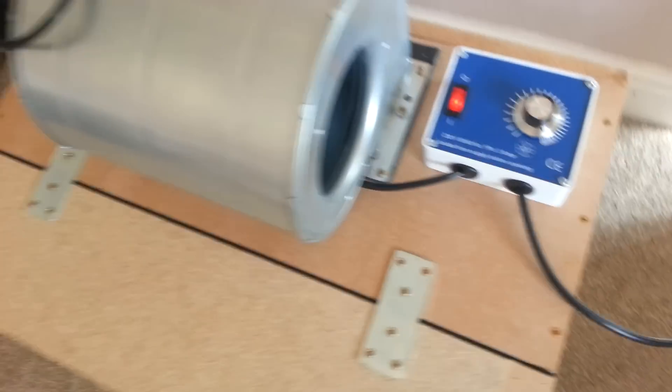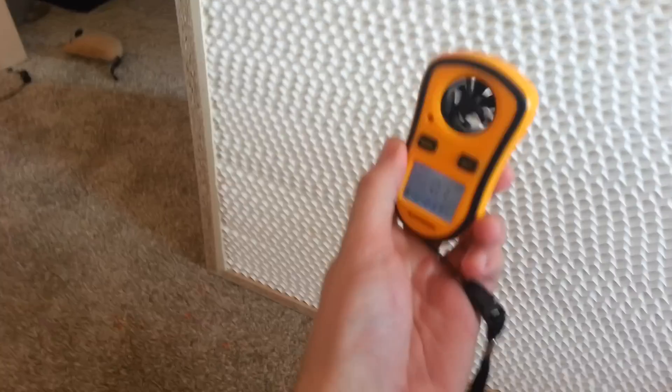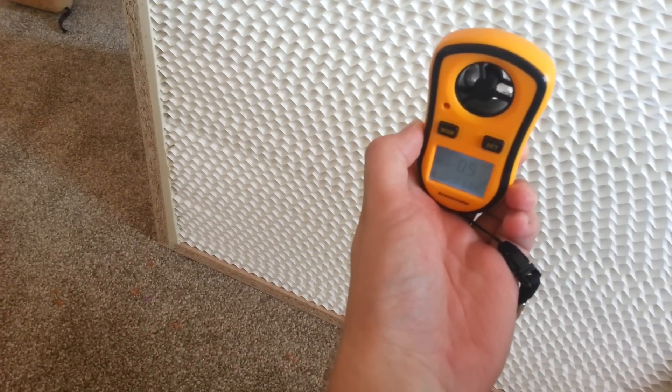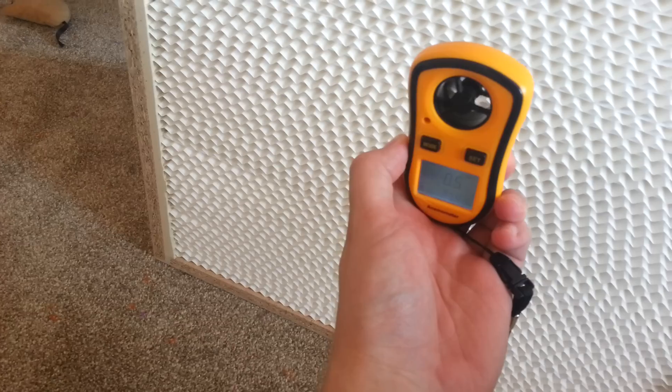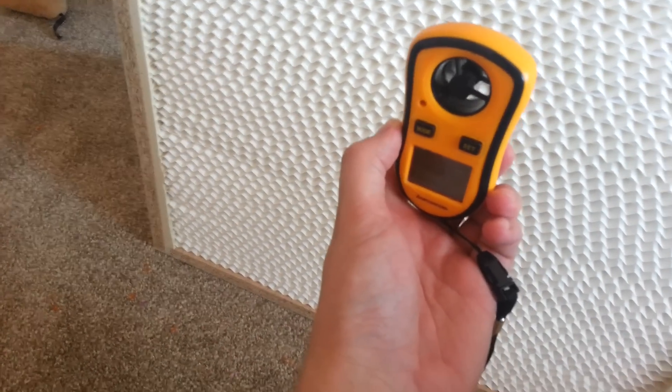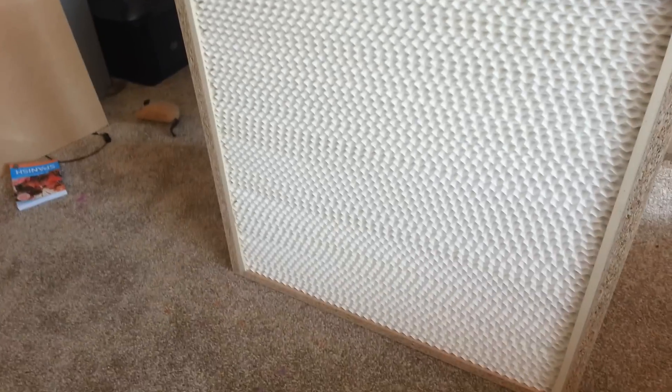So if I turn it on, the air starts to come out through the front. If I measure the airflow here, you're getting approximately half a metre a second — about 100 feet per minute — and that's about the right flow of air that you want to do work in.